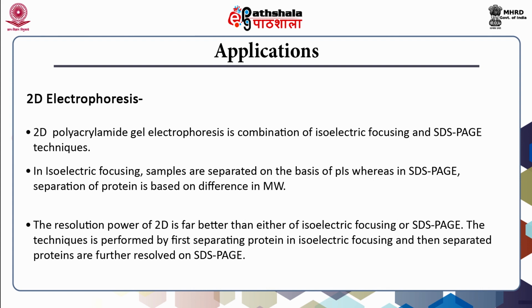The resolution power of two-dimensional electrophoresis is far better than either isoelectric focusing or SDS-PAGE. In this technique, proteins similar in mass but differing in charge can be separated. Also, proteins similar in charge but differing in mass can be separated.